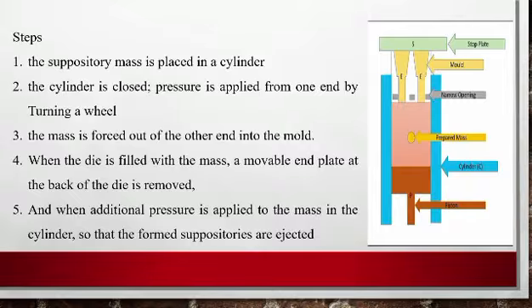When we are applying force at one end, we add the mass, the dough we have prepared. Next, by applying pressure with the piston at one end, the mass is forced out to the other end of the mold.